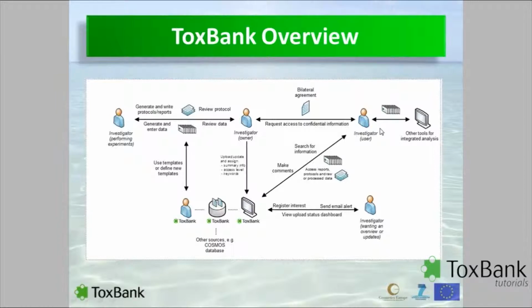If there are any access restrictions, then the investigator is free to contact the owner of the investigation through the warehouse to establish a bilateral agreement to support access to the information. Also, any investigator can request a regular update, so they can specify a particular query or interest, and then they will receive updates on new investigations, data, and reports that have been uploaded on a weekly, monthly, or even daily basis.